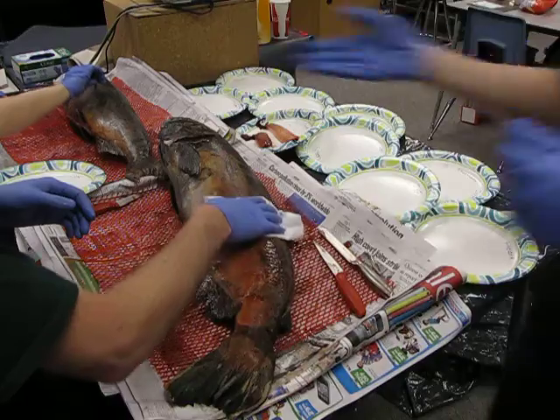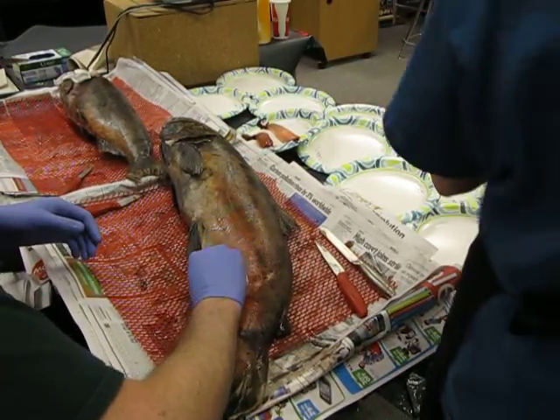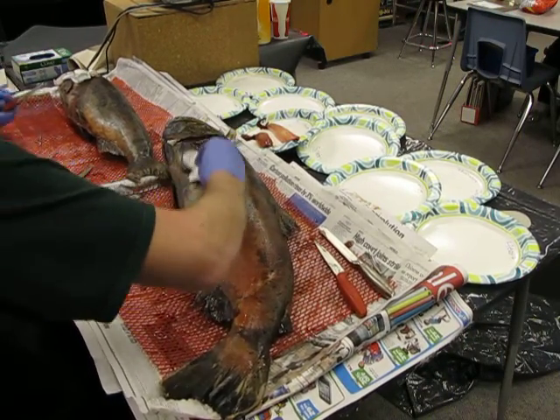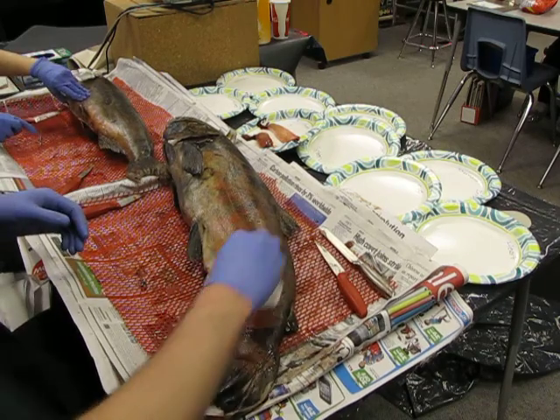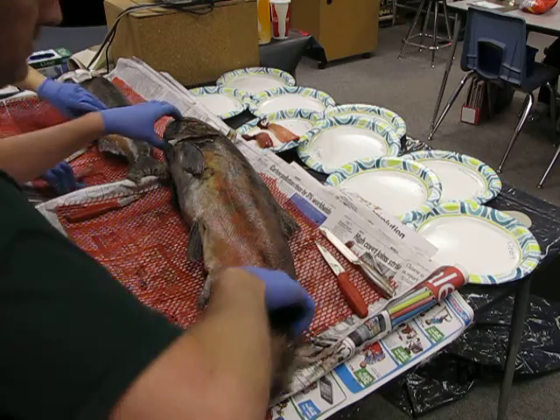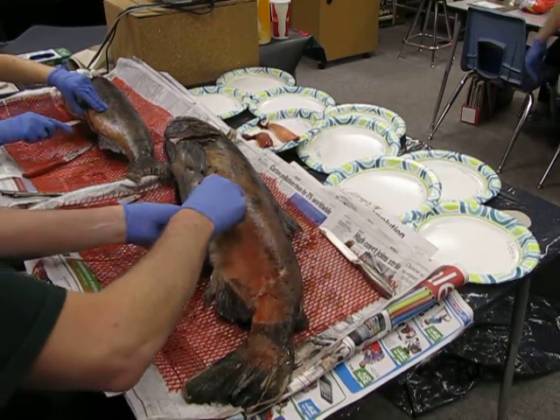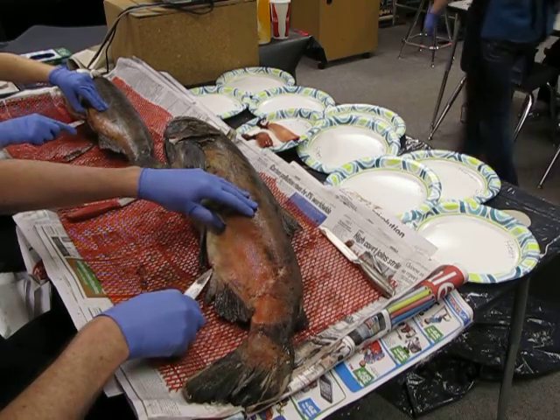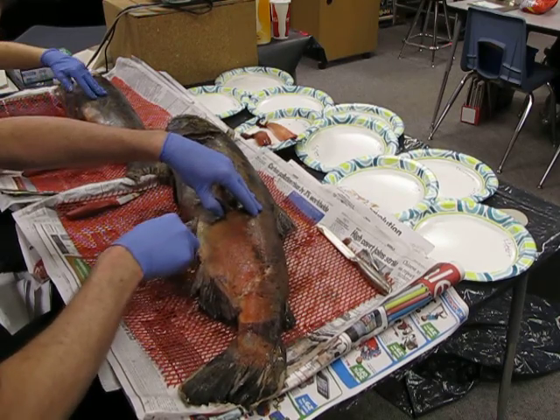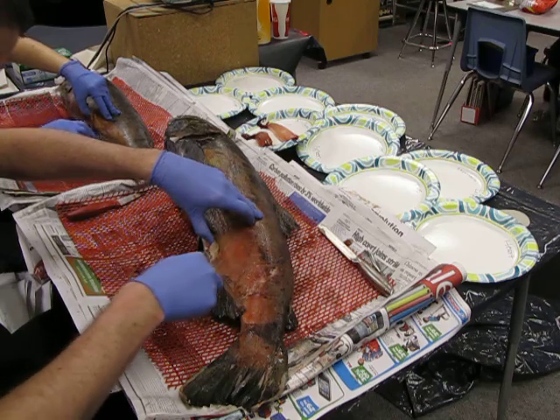There you go. Perfect. Thank you. I have a picture right here. So you can see how small these little scales are. There's just a couple of them on there. So I'll come around and kind of show you. And remember, you'll all get a chance to see everything. Okay. Let's get down to business. It's the armor for that salmon. And they overlap one another to help protect it.